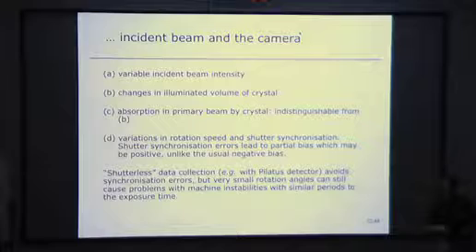Yeah, it's just absorption in the middle of the crystal. And so the beam could get through the outside of the crystal, but it was completely absorbed in the middle. It was about 0.5 millimetre, 1 millimetre. It's a huge crystal.